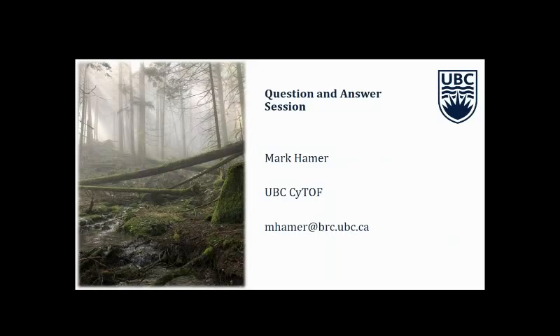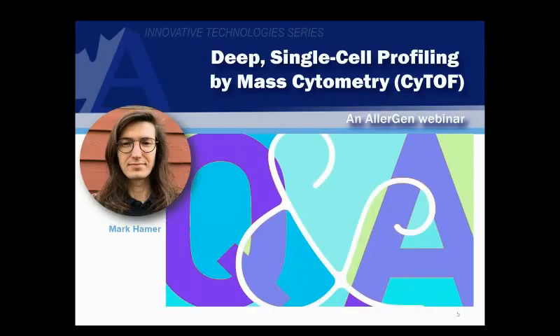The first question comes from Stephen Booth, who says, "Hi, Mark. Is it possible to stain intracellular cytokines and phosphoproteins in the same sample? Do these require different prep?" And there's another message that says, "Steve from St. Paul's, by the way, cheers."